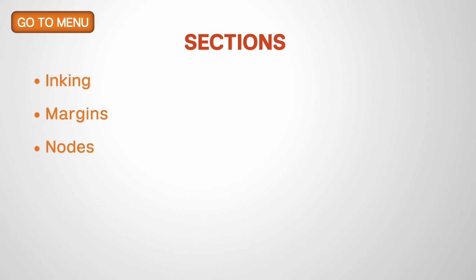We then proceeded to section the tumor, attempting to expose its full face so that we could see its relationship to other structures, and to also then serially section the normal lung to look for other lesions as well as the adjacent lung parenchyma. And then we were able to take our sections with specific focus to issues that are related to tumor staging. Size, which is absolutely critical to get to within the measurement of a millimeter length, meaning that 3.1 is different than 3.0, and so we do need to be careful about those measurements.